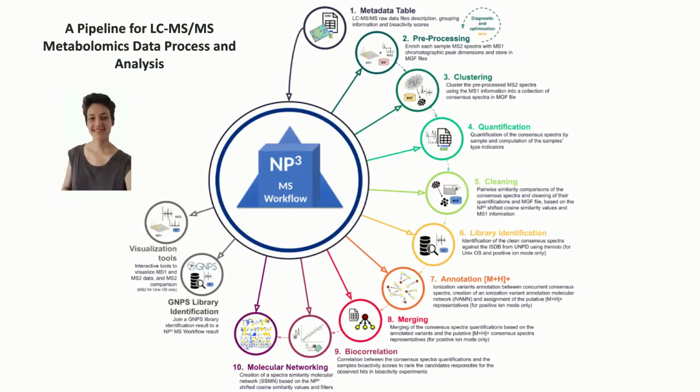Hello everyone, my name is Christina. I'm one of the developers of the NP³ MS Workflow, which I'm going to present to you today. The NP³ MS Workflow is a pipeline for LC-MS metabolomics data processing and analysis.